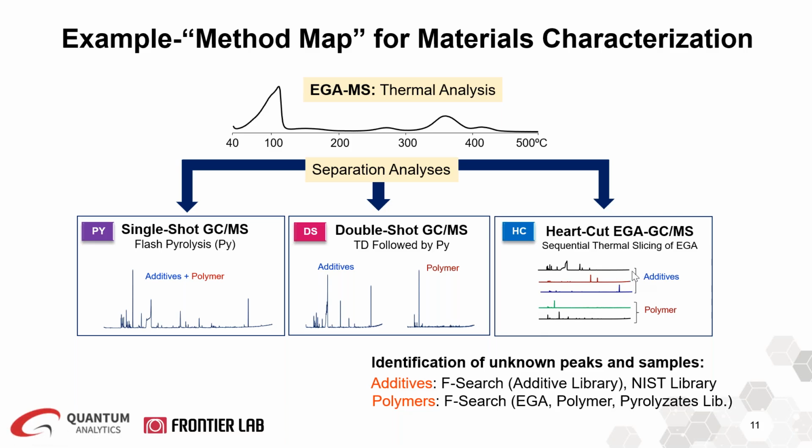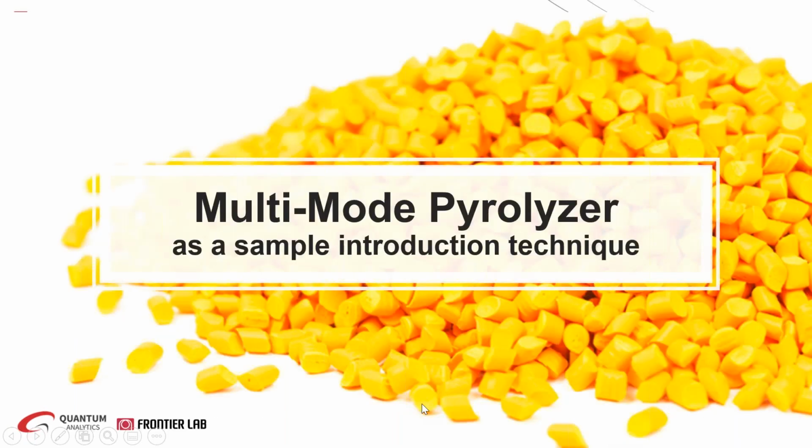Thank you, Rosine. Hello everyone. My name is Atina. I am a technical support specialist of Frontier Lab. I started my position in January 2020, and I would like to share with you my experience with material characterization using Pyrolysis-GC. We will be discussing the multi-mode pyrolyzer as the sample introduction technique.